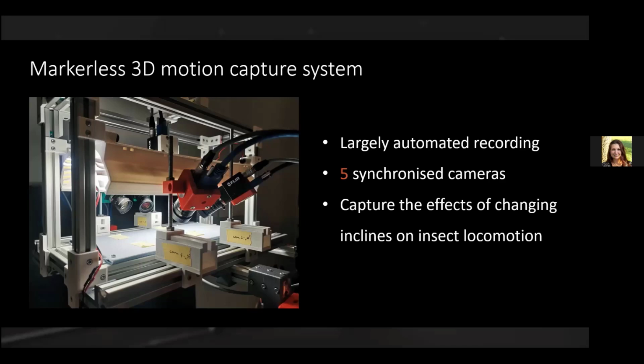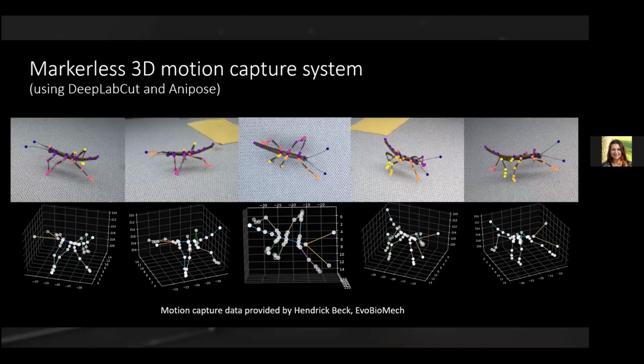But first and foremost, at least for this purpose here, what we can now do is move away from just having this in a 2D setup and bring it back to our 3D models. And this works in a couple of different steps here. The first one being, you might have heard about DeepLabCut, a great software to do so-called 2D pose estimation without any markers. So rather than having to obstruct your animal while it's walking around, you can define essentially landmarks on your model where you want the machine learning model to re-identify it.